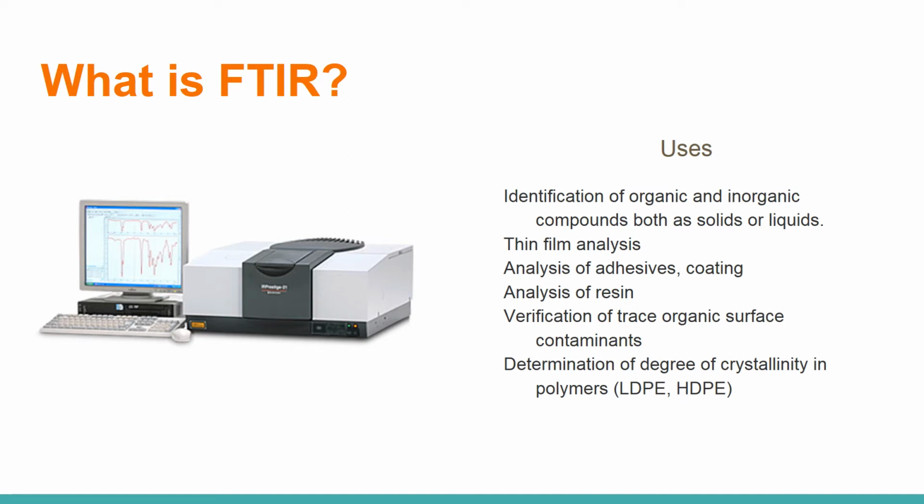This can give someone the information about the chemical binding structure by using the data references. So it can identify both organic and inorganic compounds. It's great for thin film analysis, adhesives and coating especially. And another thing it can do is determine the degree of crystallinity in polymers.